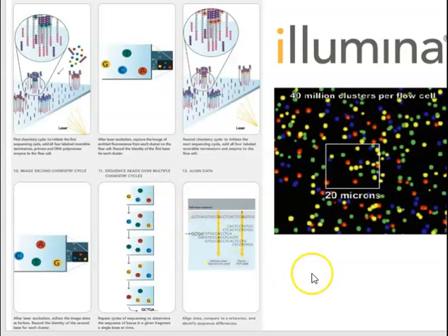Okay, I think that's probably enough on the Illumina sequencing platform. As long as you understand the concept of fragmenting the DNA, attaching oligos, binding to a flow cell, performing bridge amplification, and getting as far as doing the first read, then that's probably as much as I need you to do.